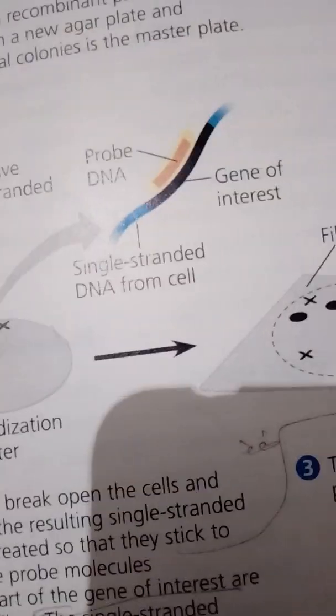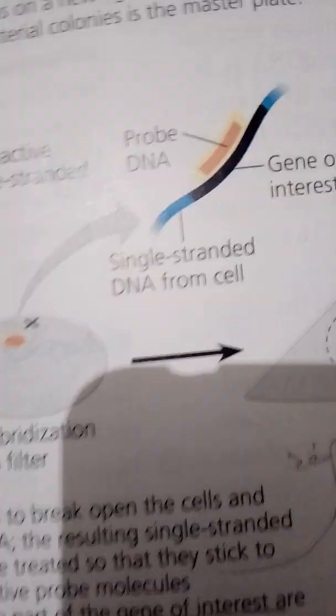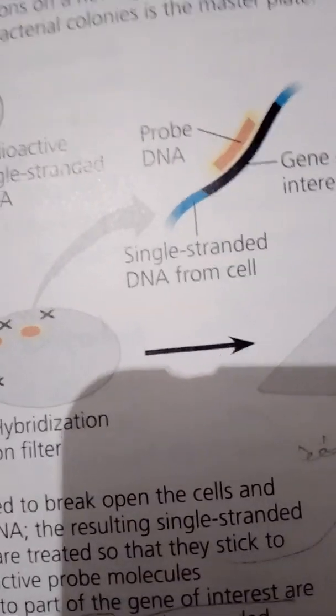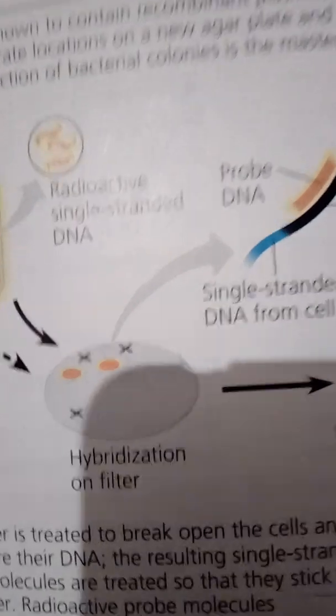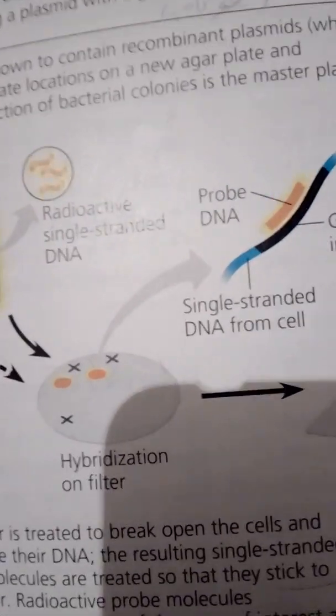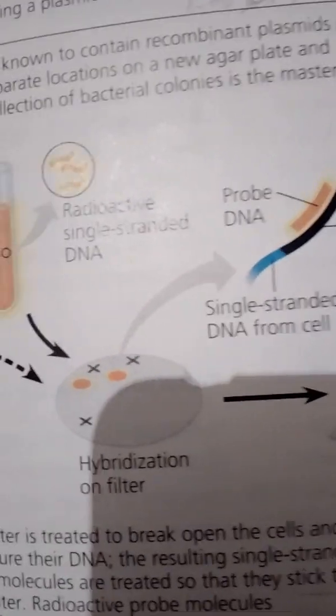In the 3' to 5' direction. Each probe molecule, which will hydrogen bond specifically to a complementary strand in the desired gene, is labeled with a radioactive isotope or a fluorescent tag, or so we can track it.